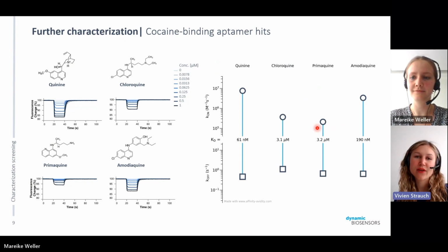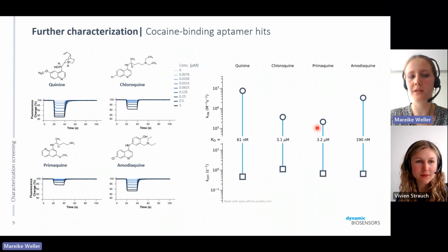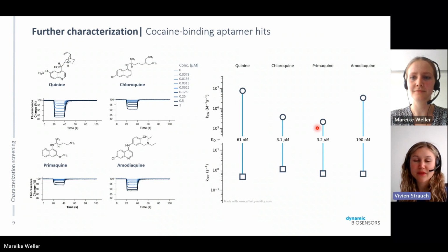Okay, then we have another question, whether you also tried with an RNA sequence. In another measurement setup, I tried with an RNA, but not for this, since this was more the proof of concept and also the establishment of the method. I first went easy from DNA, but of course, this also works with RNA sequences. If you have any specific examples with RNA sequences you would like to try, you're of course very welcome to reach out to us and we can organize a demo or just do some demo measurements on our side. So just get in contact.